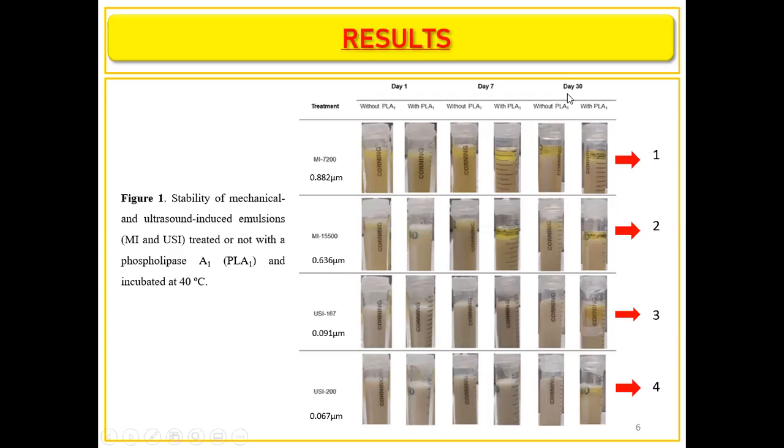And of course at 30 days, we see that separation also in treatment number 2. So even if we have an important separation of phases in the mechanically induced emulsions, we don't see that in the ultrasound induced emulsions.